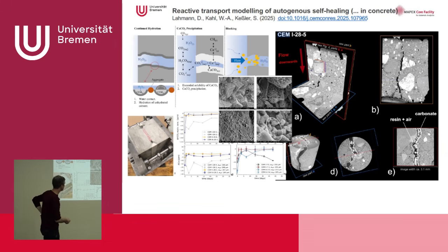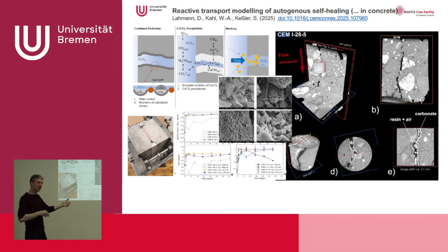At least these are very small samples here, but it shows something very important: very locally you have the growth of calcite or carbonate, or magnesium silicate in other places. So even if you have this bulk situation where you have a reduction of the flow, the precipitation as a reaction of the self-healing component is sometimes very local. And we could focus it in comparison of different materials, different kinds of cements, so we saw different ways of closure of these things.